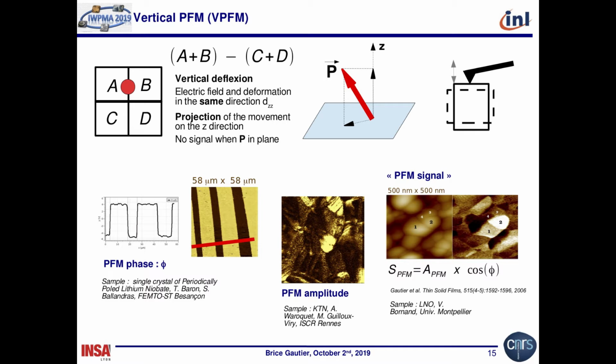You can analyze that the projection of this grain two is more pronounced in this direction than grain one, because the brightness of this grain there is higher than the brightness of this grain there. So from this mixed signal and having information about your sample, you can deduce some information about the relative orientation of the grains. So this is quite interesting to understand.